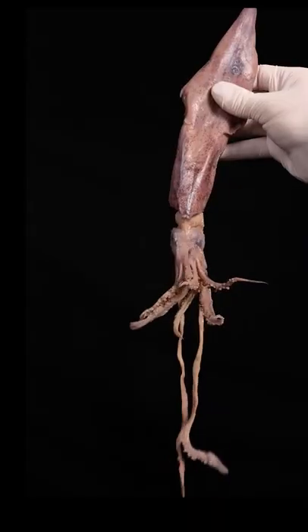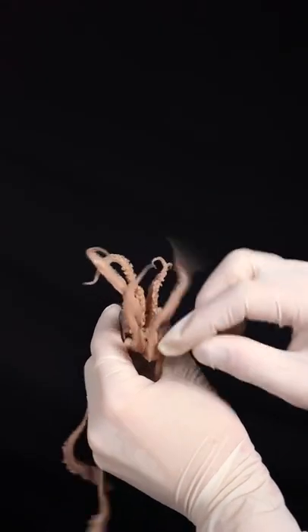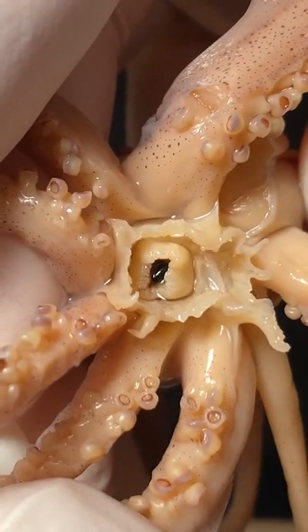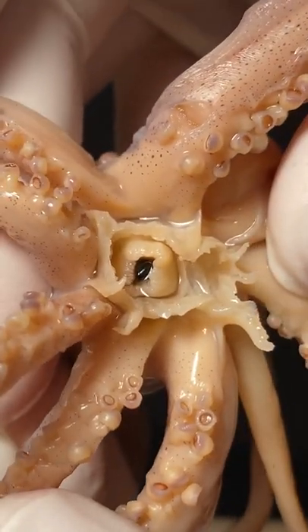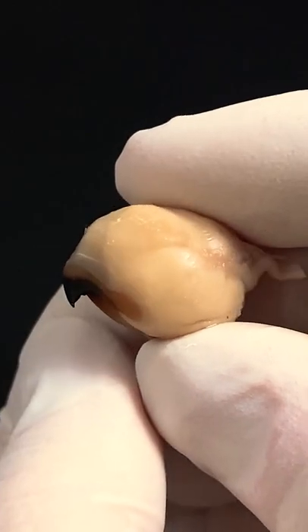This is a short-finned squid from the Atlantic Ocean. If I dig around this squid's arms and pull them back, I'll find a tiny hole in the middle of its body. Hiding inside this hole is a strange ball called the buccal mass. It's basically the squid's mouth.